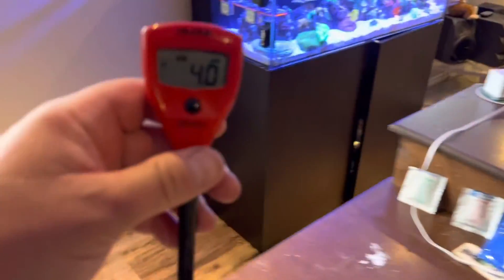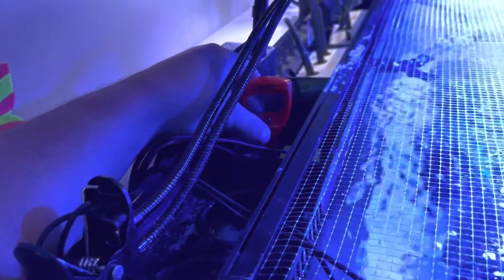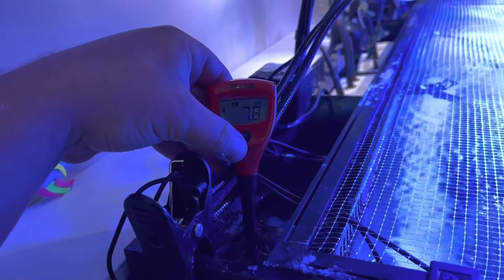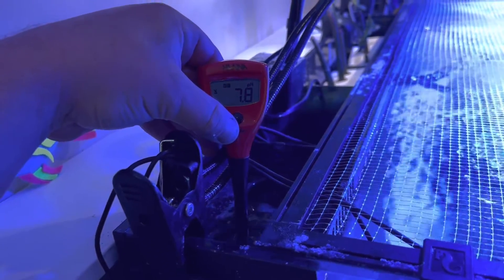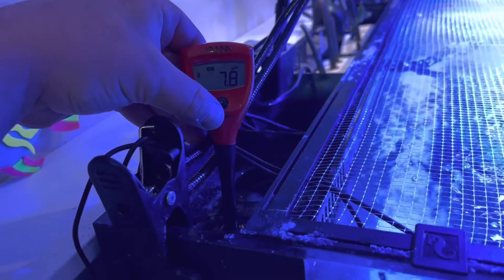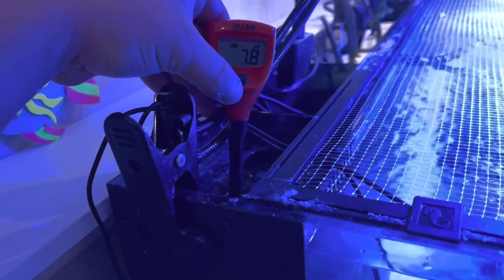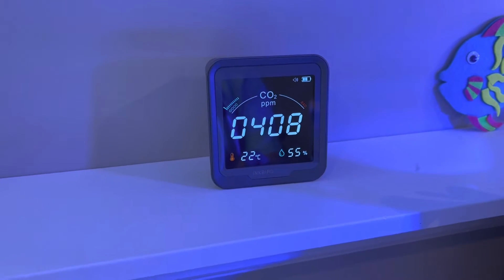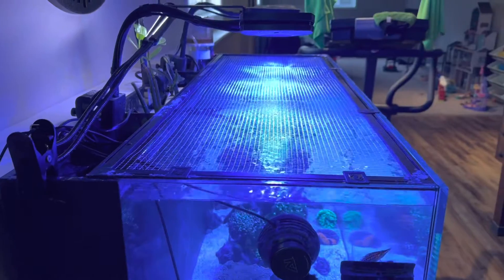Let's come over to our tank and dump it in the back chamber. I just changed the CO2 scrubber media yesterday. It should be 7.9 — it was okay, it was 7.9 two hours ago but it is getting to evening. I was at 7.6 pH yesterday with my media burned out. This tank tends to run low pH. There it is — 7.8, which is not bad, not great. I bought an Inkbird CO2 monitor: 408 ppm. Outside it's only 400, so 8 ppm is not enough to cause this tank to have a low pH in my opinion.